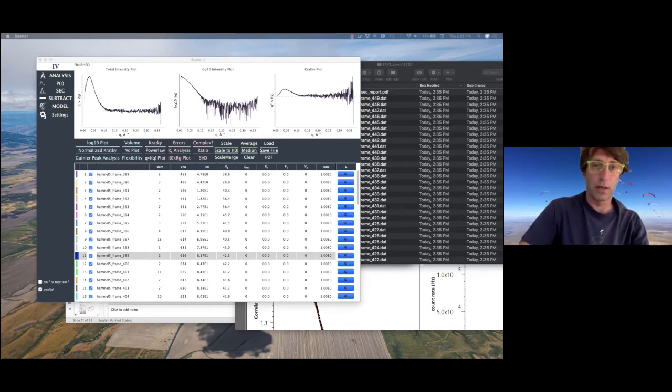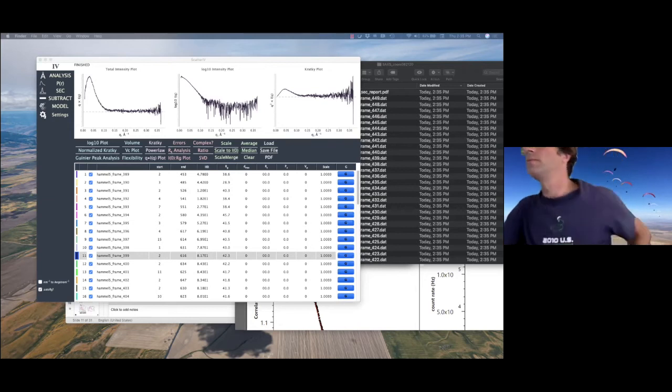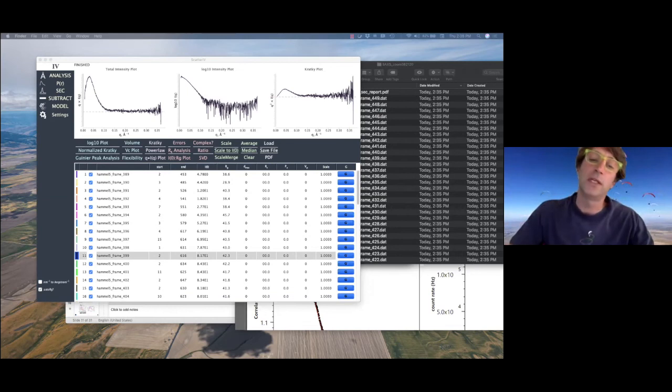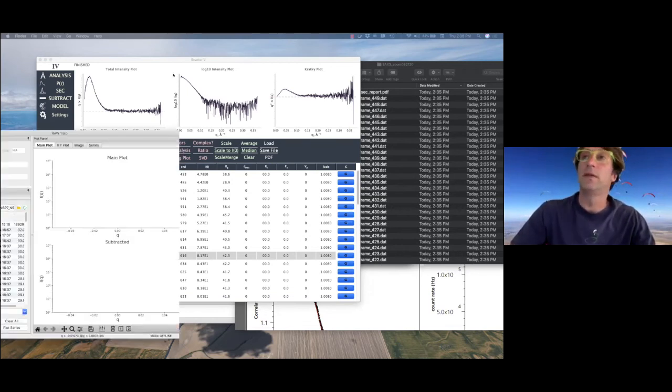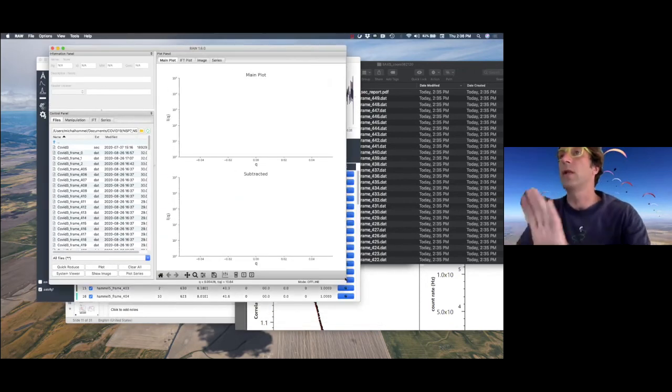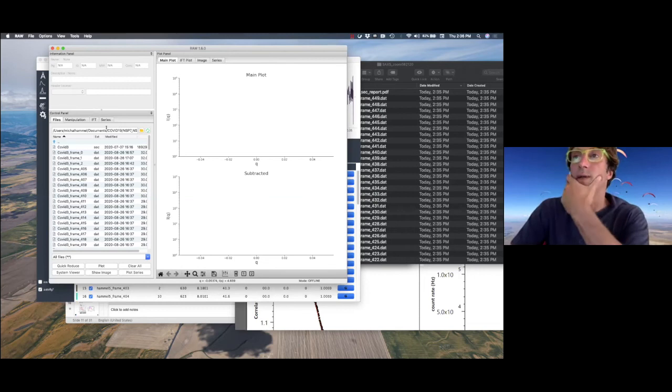Okay, I have it already open here. And RAW, as Jesse already mentioned, has this capability to deconvolute using SVD. Think about the convolution of different components from the signal that may overlap each other.